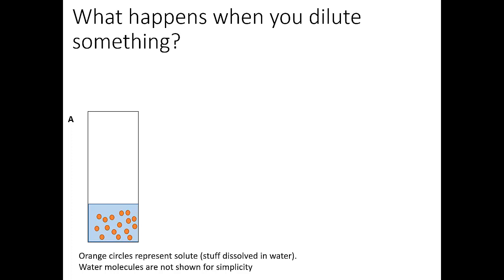So for Lab 5, we are going to be making solutions and doing dilutions. And the first thing I want to talk about is what actually happens when we do a dilution.